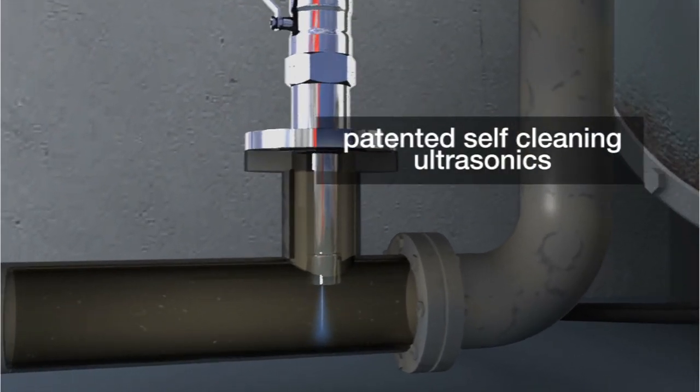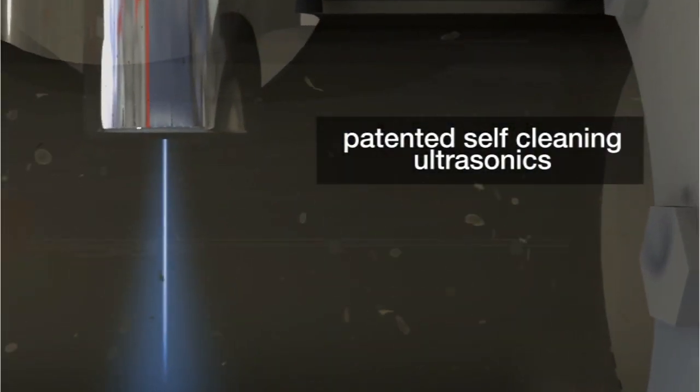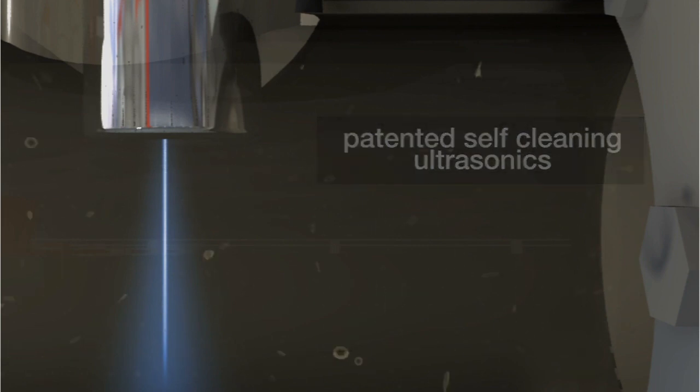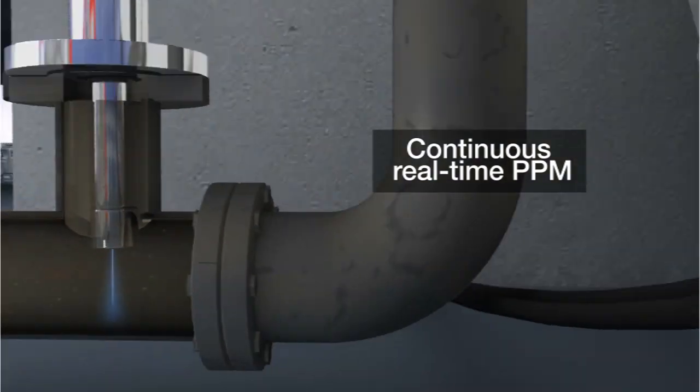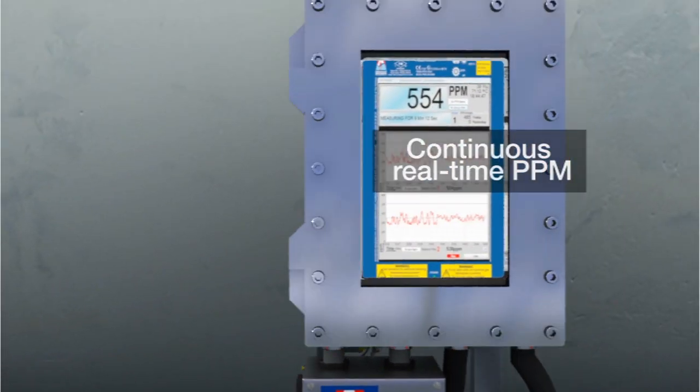The probe utilizes Advanced Sensor's patented self-cleaning ultrasonic mechanism to ensure no operator intervention is required. Continuous real-time PPM is measured and reported.